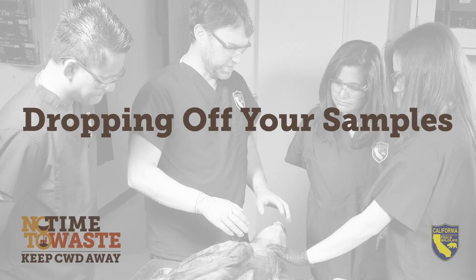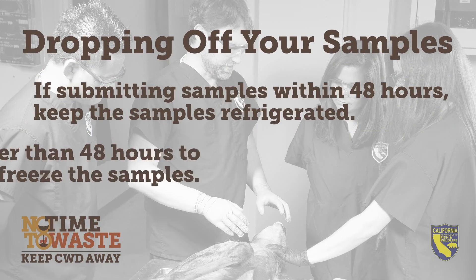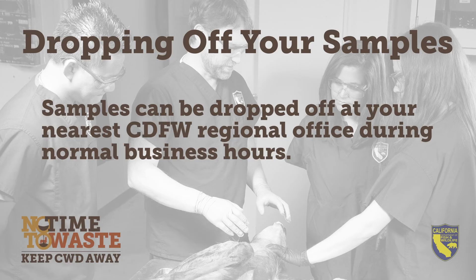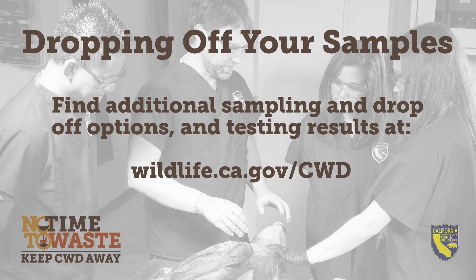The specimen bag can be refrigerated if you are submitting it immediately, or frozen if submitting it at a later date. Once your samples are properly packaged, you have a few options for getting them to CDFW. If dropping them off within a day or two, they can be refrigerated. If it will be more than a few days, store them frozen. You can drop them off at your nearest CDFW regional office during normal business hours. If you're not sure where an office is located, you can find them listed at wildlife.ca.gov/regions.